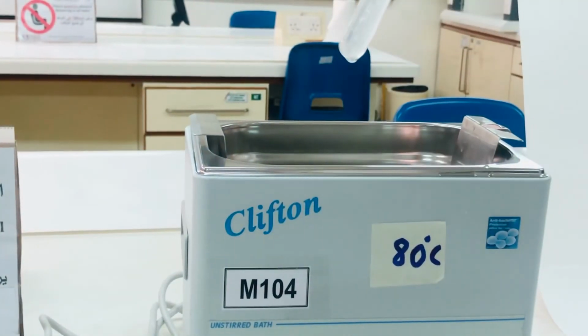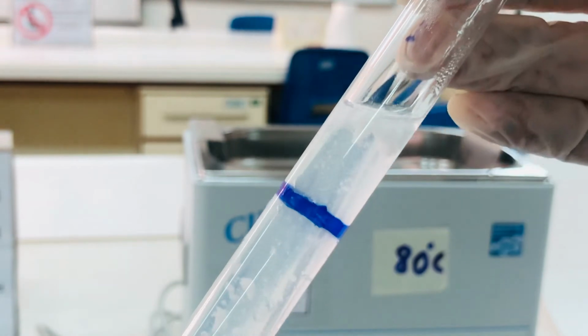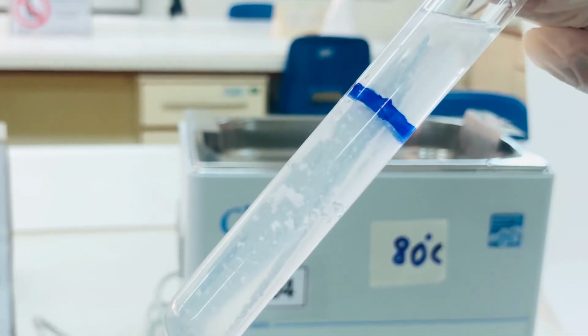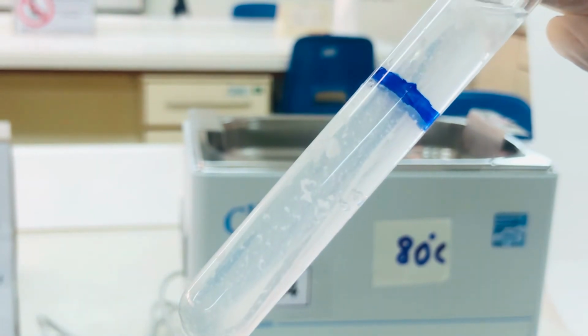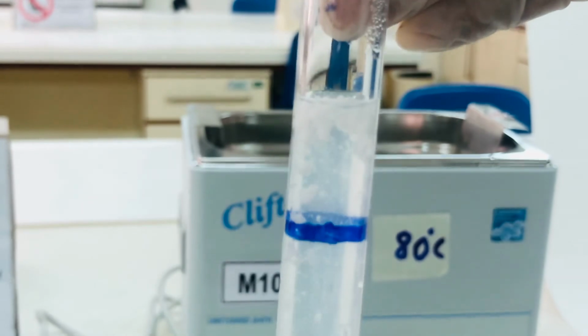The curdling of milk has taken place, you can see, in 80 degree, and we have recorded the time. Likewise, we are going to record for all the samples.